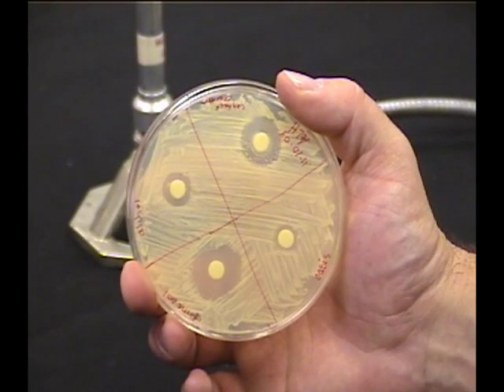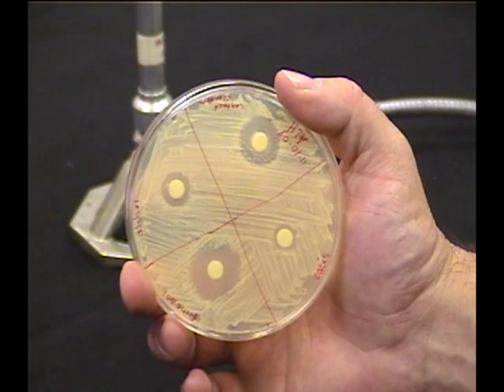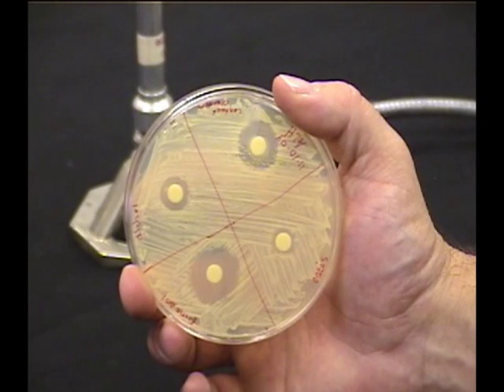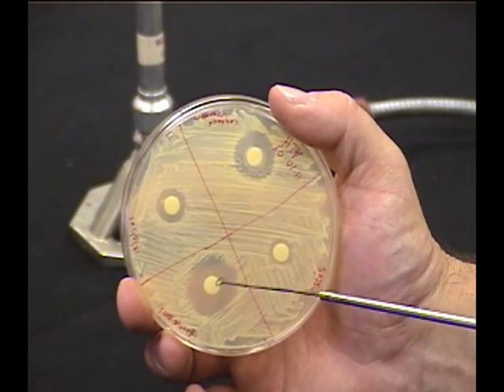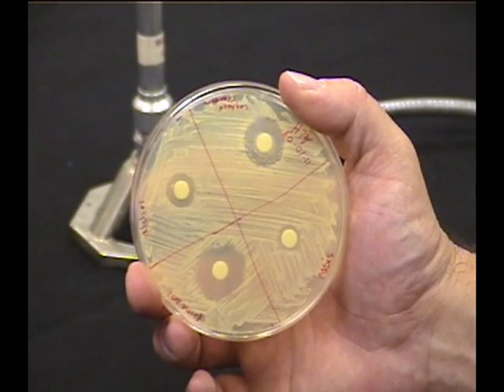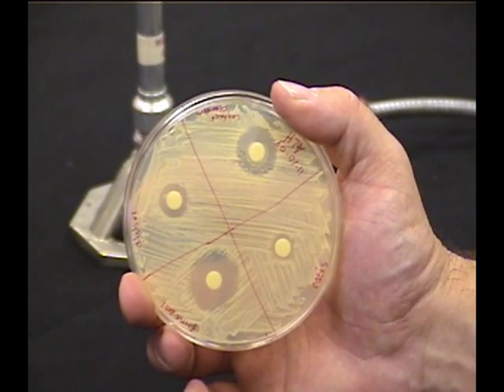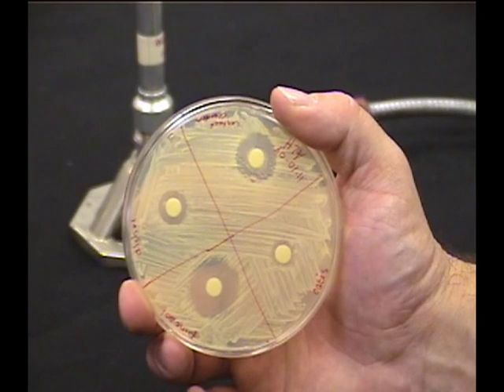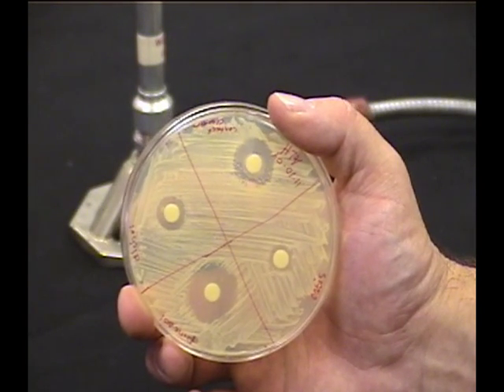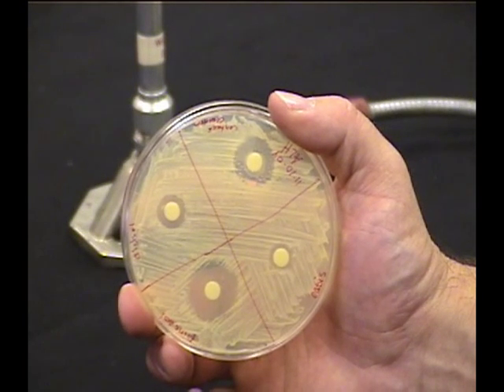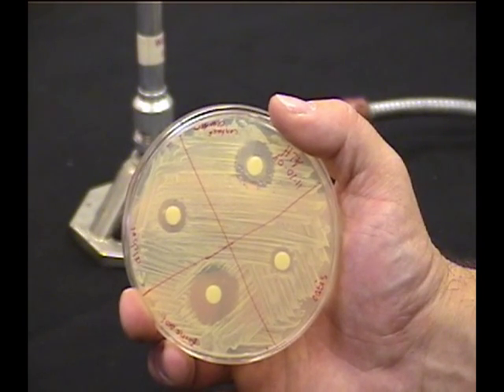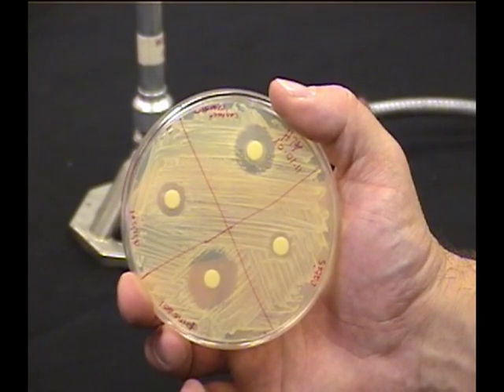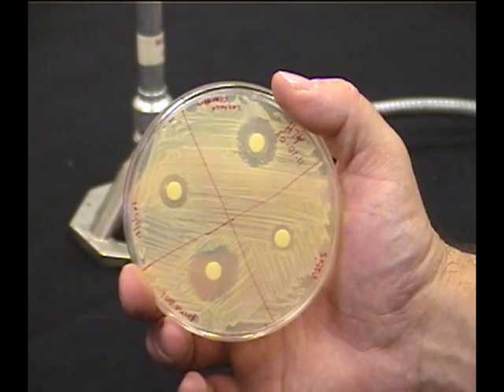The point on all this is you have to test individual organisms, either with the antibiotics or the antiseptics. You can't say that one antiseptic or one antibiotic works the same on all organisms. I know we said that antiseptics and disinfectants are nonspecific, but turns out they don't work equally on all organisms. There are some of them, some organisms that even like to grow on some of this stuff. They actually use it as a food source, which is kind of a problem.